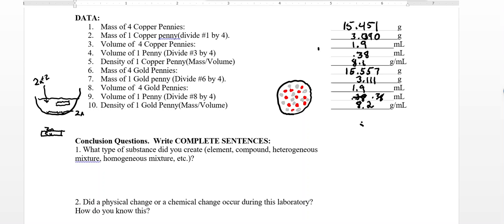So, homogeneous or heterogeneous? Well, you look at it, it looks gold. If you had not determined its density, you would have thought it's gold. You could probably get a freshman to be convinced that it is gold. No offense, freshman here. Because what are we seeing? We're seeing a combination of coppery colors and a combination of zincy colors.